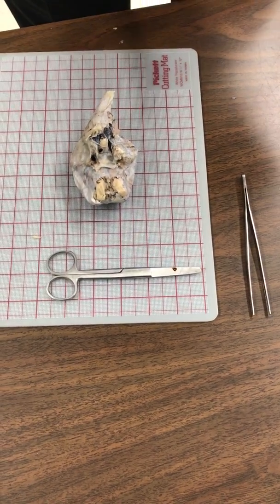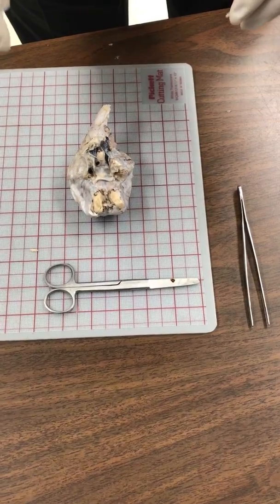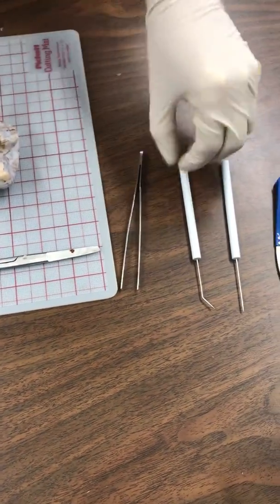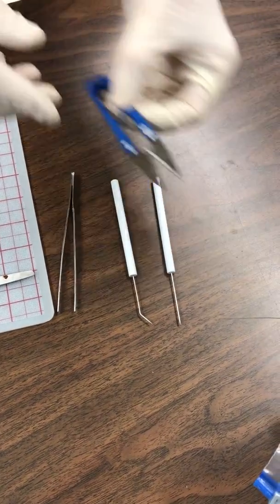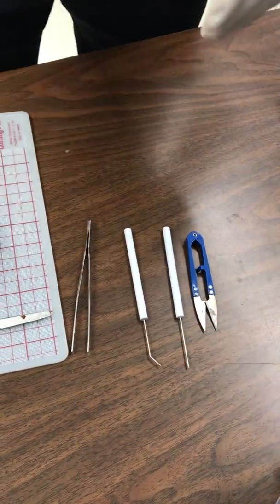We're going to be removing the dura mater from a sheep brain. The tools I will be using are surgical scissors, some forceps, probes, and these shears that I got from a sewing kit — they're going to be easier to get through some of the dura.